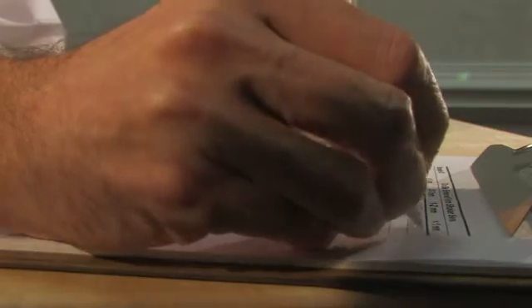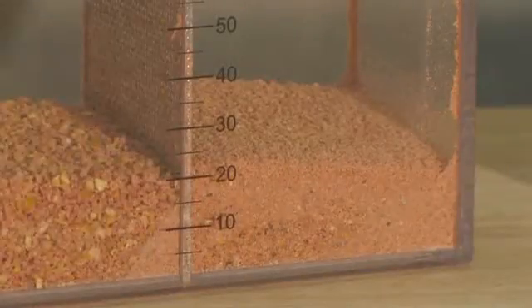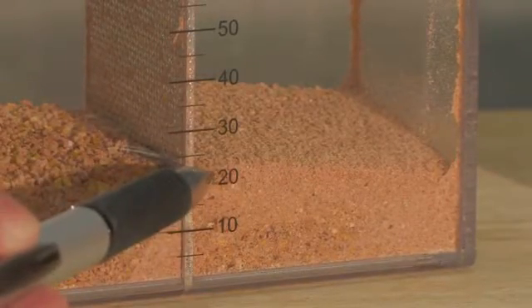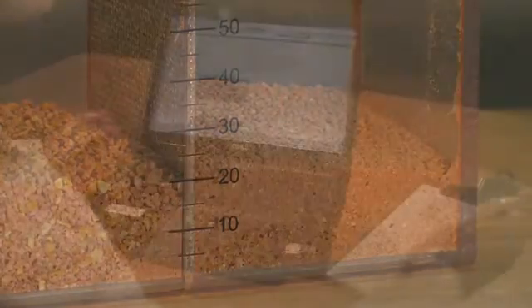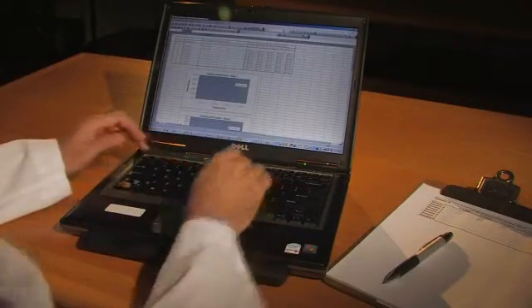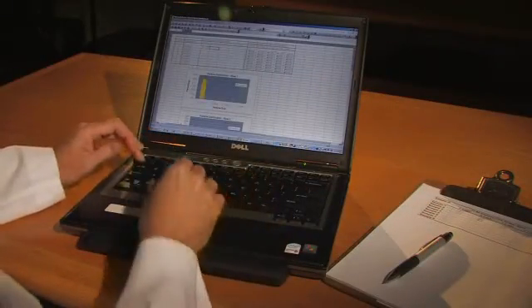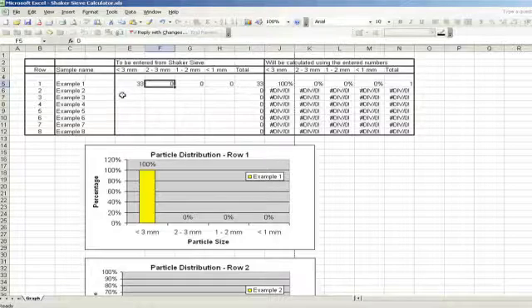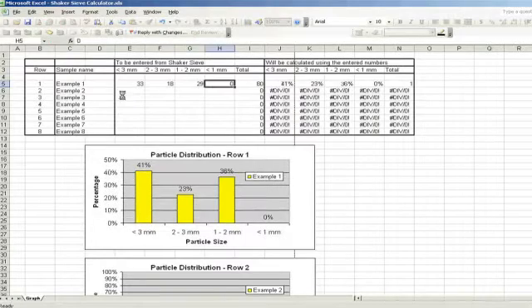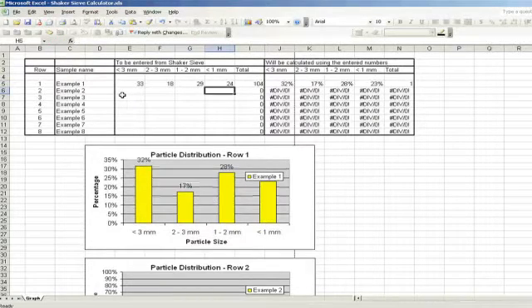To calculate the percentages in each compartment, add the values of all four compartments together, resulting in a total value. Then divide the value of each section by the total value to produce the percentage. Alternatively, you may also use the spreadsheet tool provided with the sieve. The spreadsheet will automatically calculate the percentage of each particle size fraction.